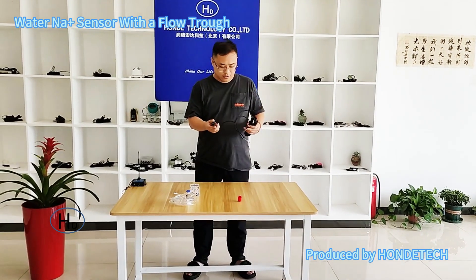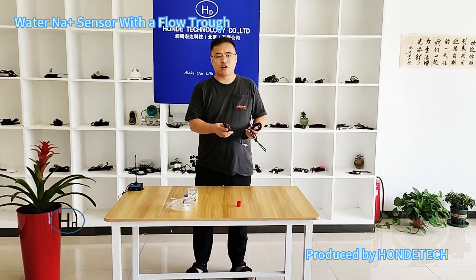Hello everybody, welcome to Maui from Golden Tech. Today I will introduce our water sodium ion sensor.